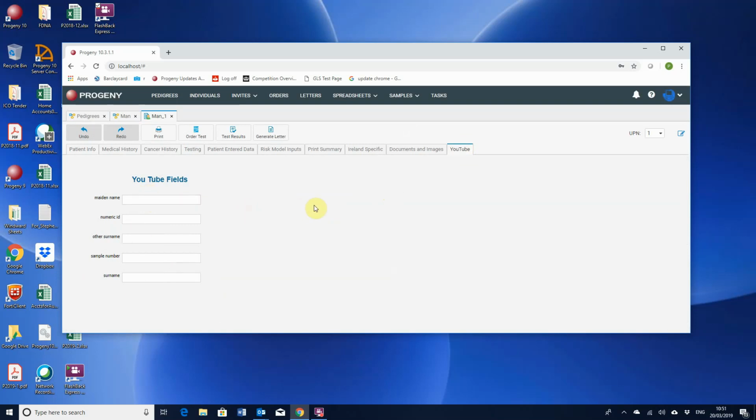You can also add in images and you can make them larger. So there's all sorts of things you can do here. But when you're looking at design for data sheets, this is the place to do it.